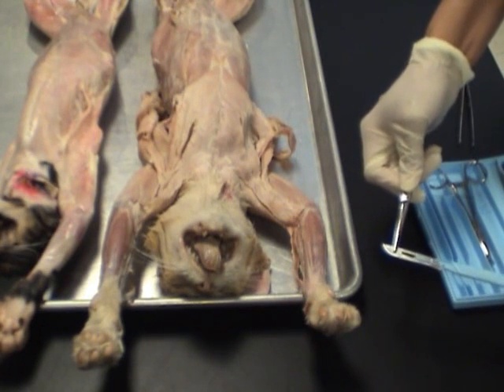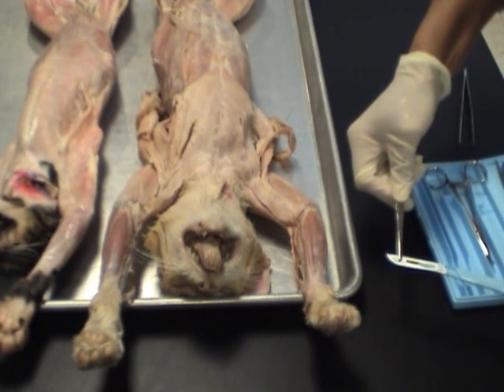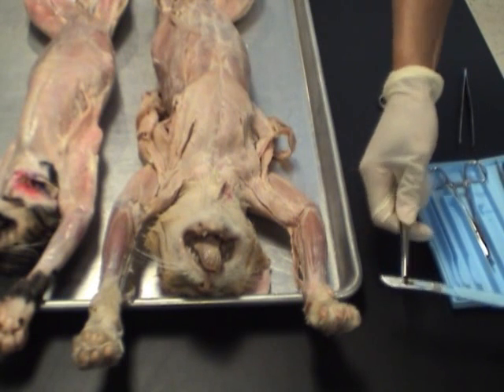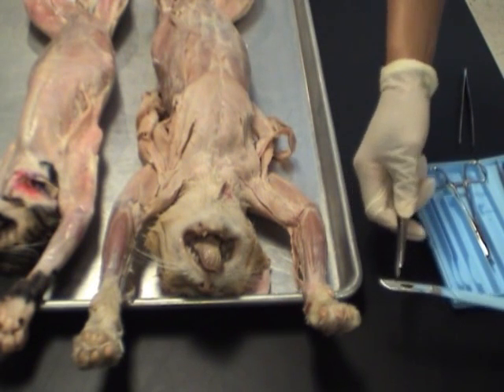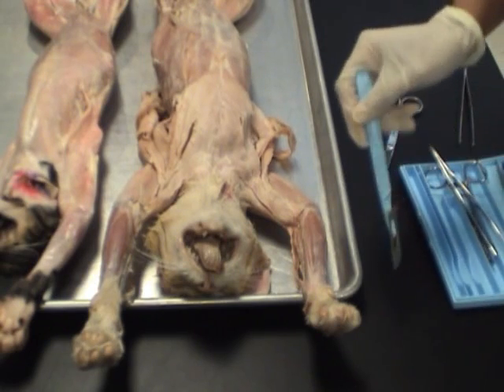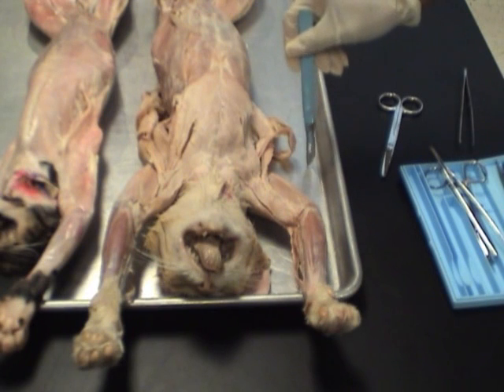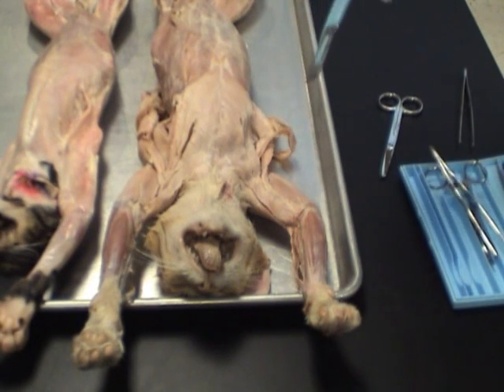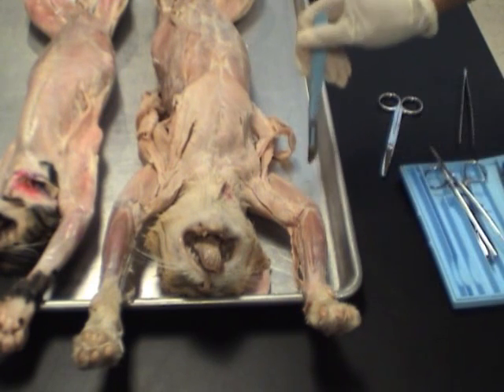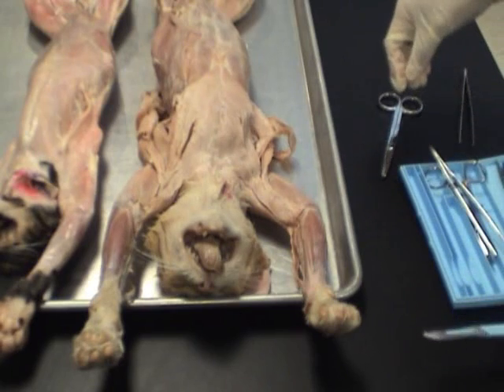So we're going to go in this way, and we're going to slide it inward. Sometimes it won't go, so you may have to press down on it a little bit with tension, and then it snaps into place. Obviously, always use a hard surface when you're pressing in so that it will go in easily. Okay, so that's the scalpel.